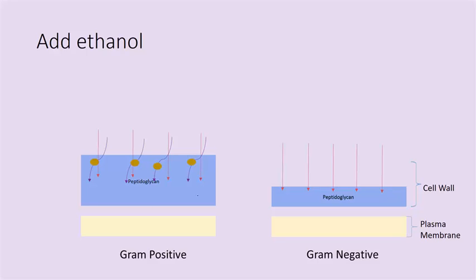When you add safranin to gram-positive cells, that safranin goes into the cell wall and stays in there. However, crystal violet, that purple stain, is much darker and overpowers the visibility of the red stain. So safranin's in there, but crystal violet basically masks that, and the gram-positive cells still appear purple when you look at them under the microscope. So hopefully that explains how we get those different cells, gram-positive and gram-negative, appearing either purple or pink under the microscope.